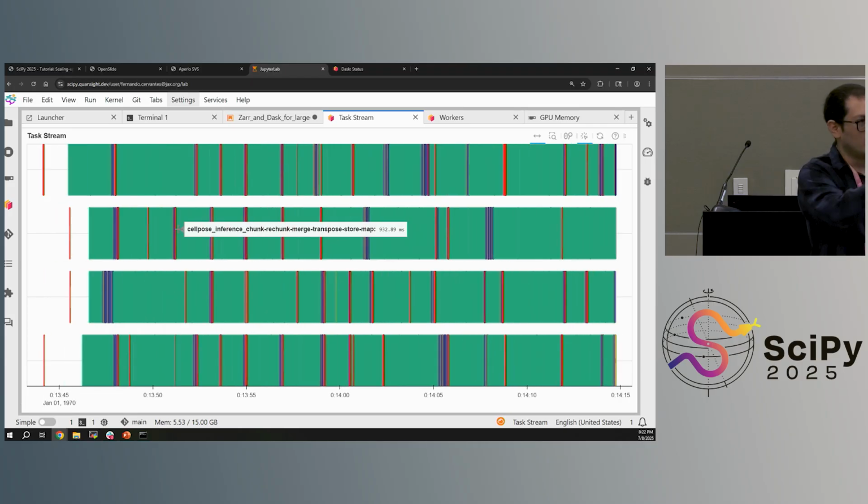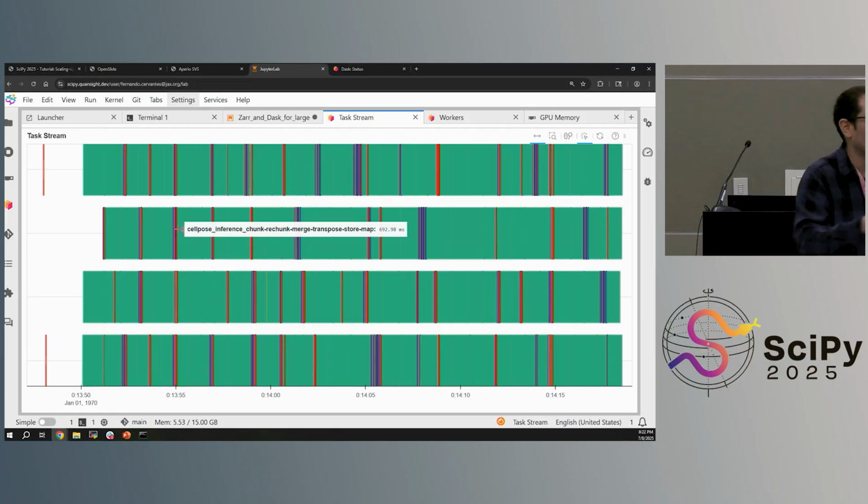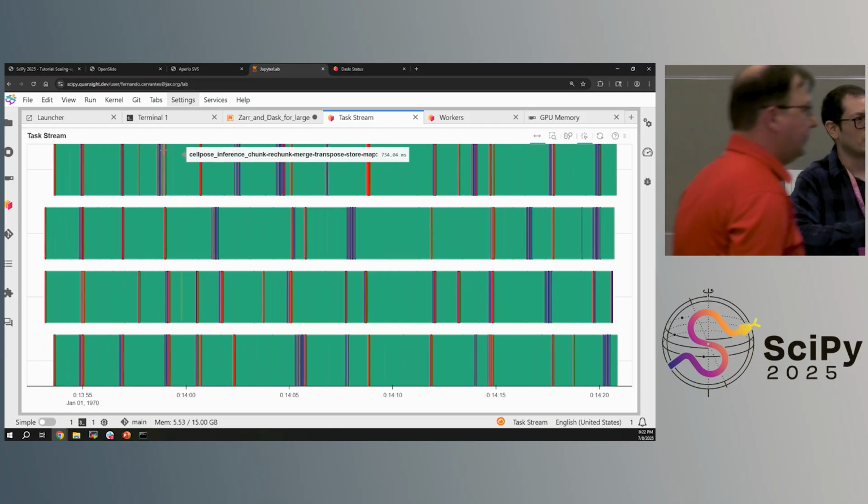Multiple frames. You get a feature map of each frame. You can aggregate those samples. Yeah, exactly. You apply classification.